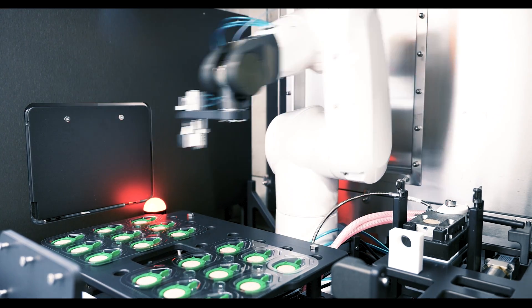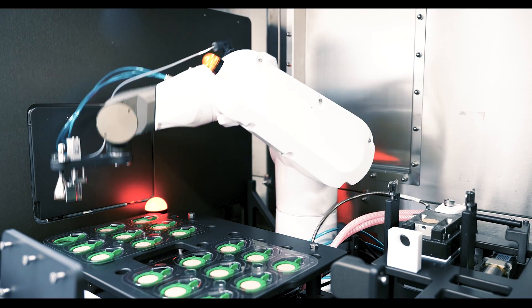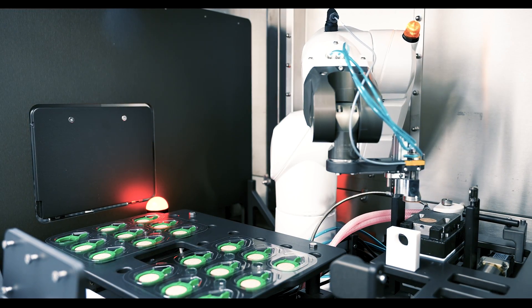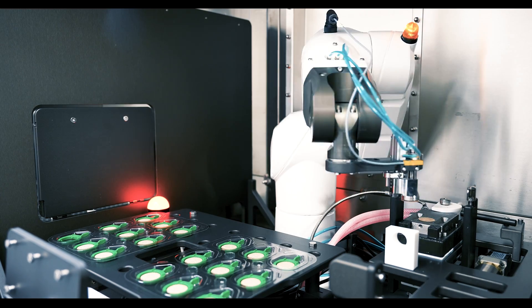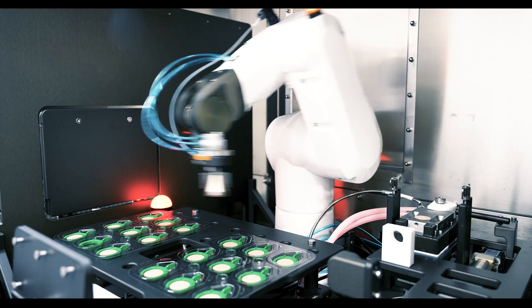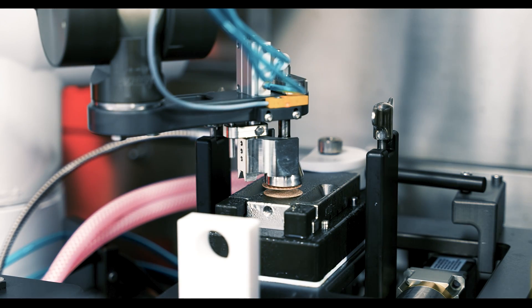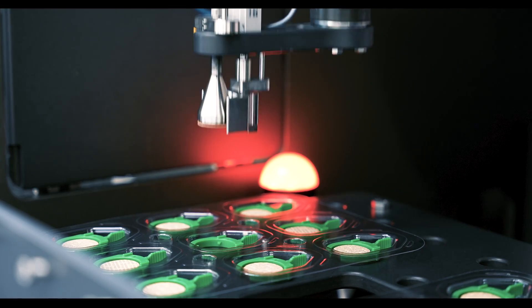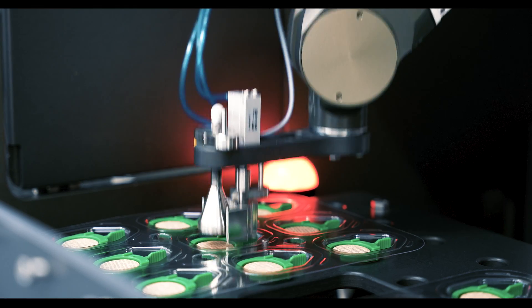The trays are then removed and placed onto the table of the coating station. The robot is actuated depending on location, it will come and select which part goes to the coating station. After coating and drug is applied, the SMTS patch is returned to its original location with accuracy by the robot.